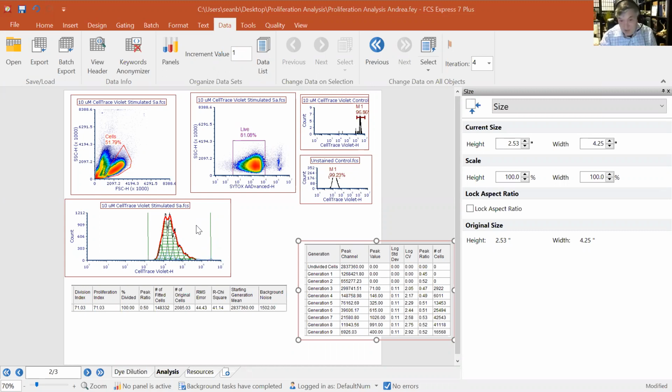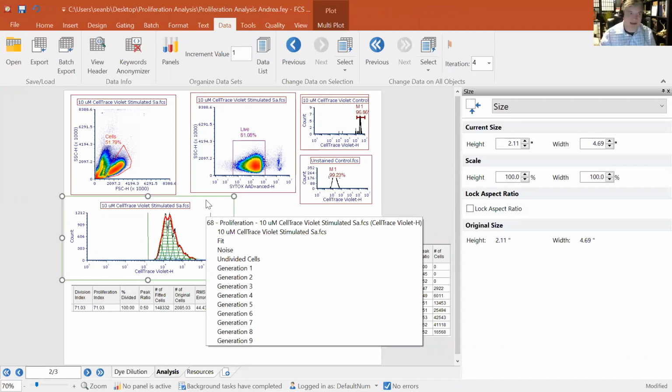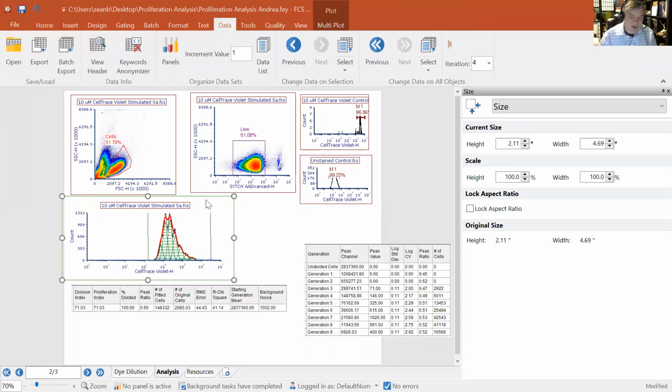So, depending on what you're looking at, and also if you need rare cells, right? The one thing I didn't show yet is you can apply gates to these and look at your CD4 positives and your CD4 negatives. Well, if you have some sort of rare event population and it's 10% of your cells, you might need to collect 1,000,000 cells just to look at 100,000 of the ones that are super interesting. So there's no cut and dry answer.